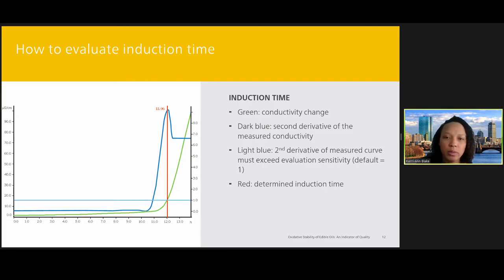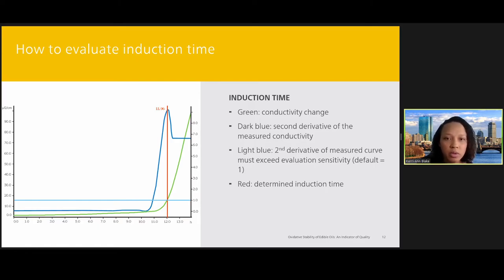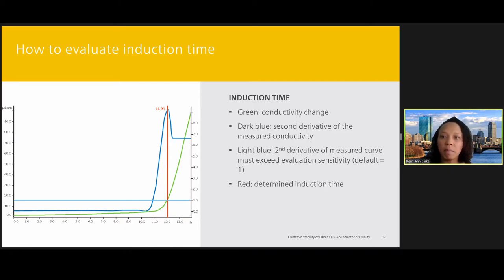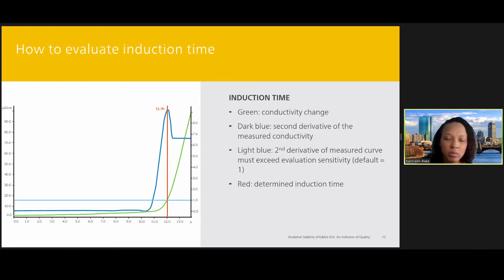Here we have the output of an oxidative stability measurement performed by the Ransomat. The green curve shows the conductivity change over the time of the analysis. The dark blue curve is the second derivative of the conductivity measurement. The light blue line is the evaluation sensitivity, and the second derivative must exceed that line for the measurement to be considered viable — the default is one for most applications. The red line indicates the maximum of the second derivative curve, and this determines the induction time.